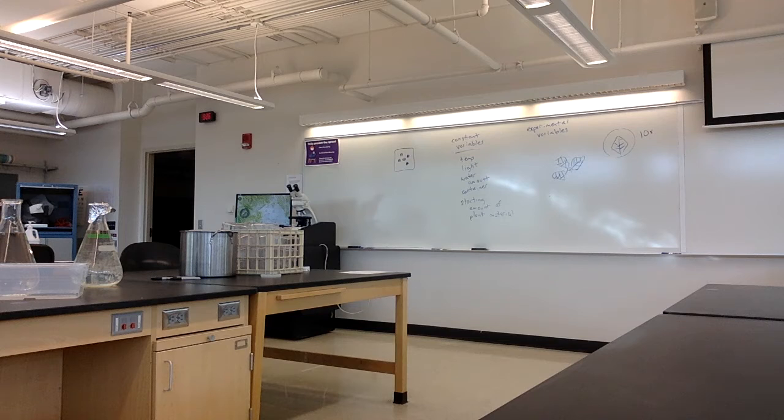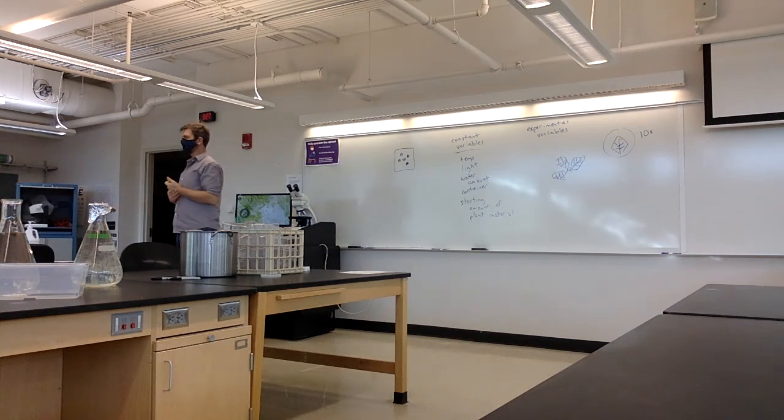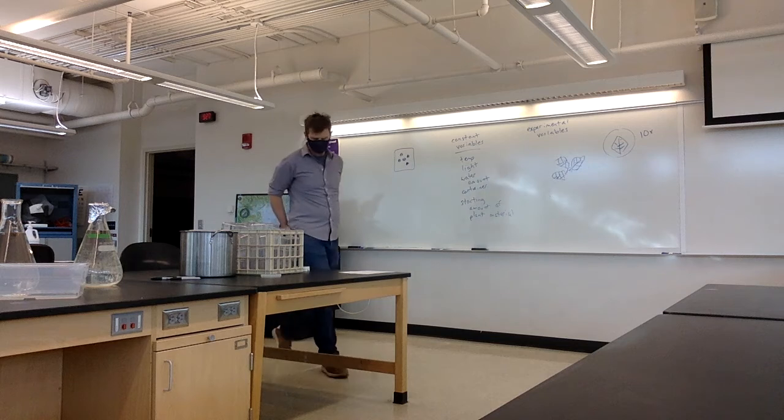So you've got certainly a lot of material to choose from. Along with the ferns are these little green circles. Those are actually a flowering plant called duckweed, or Wolffia. And I'd like to try to separate those out if we can. So you might need a couple of washes with these. You transfer the fern and keep transferring until you don't have any of the duckweed left. Just as an extra variable, something we probably don't want in there. They might grow and take over. They might not have any effect at all. We'll just try to keep them out of there.